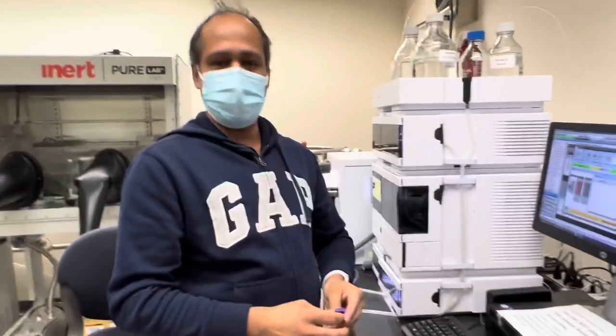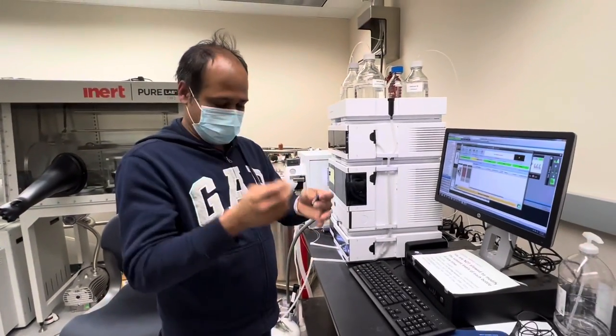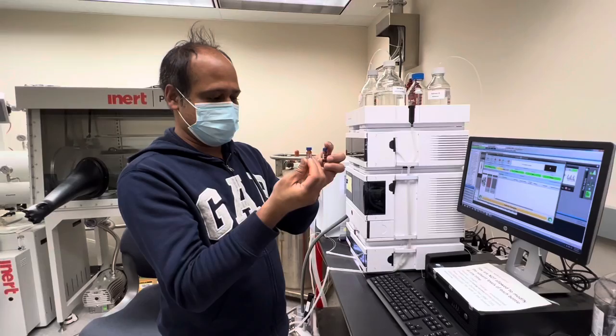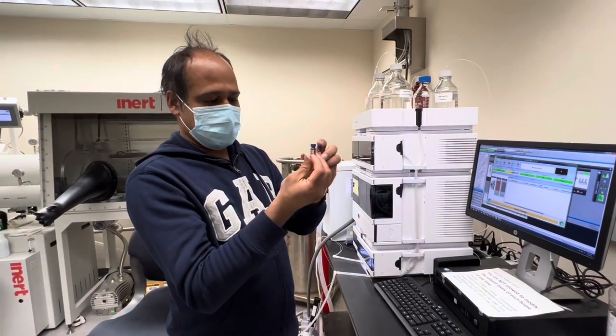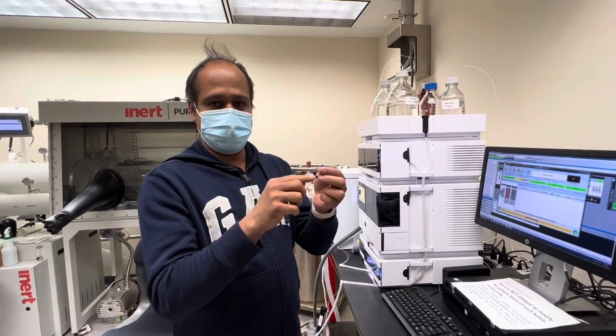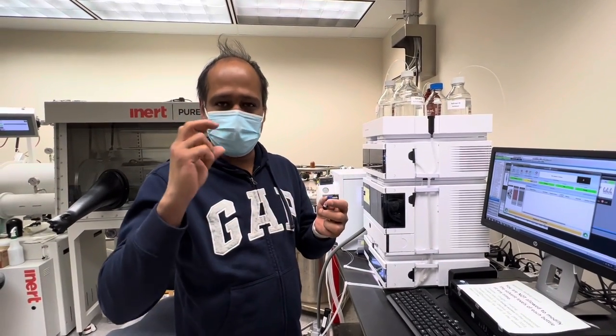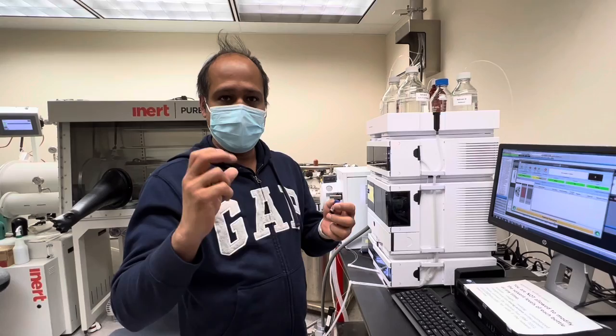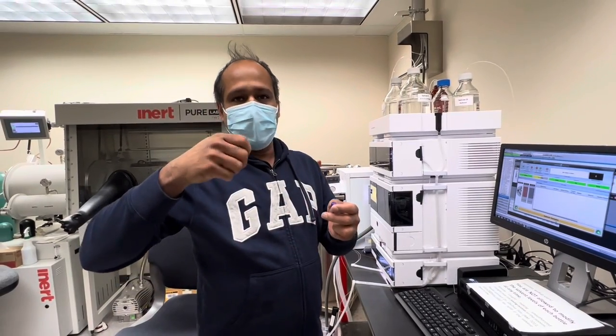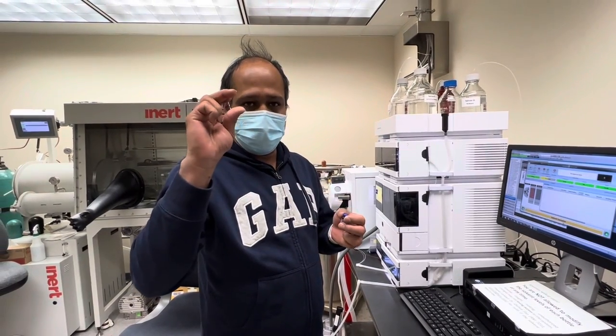So now we are going to do the LC-MS thing. Suppose you made the sample, you dissolve the sample in HPLC grade methanol and then you have to take it with a syringe.